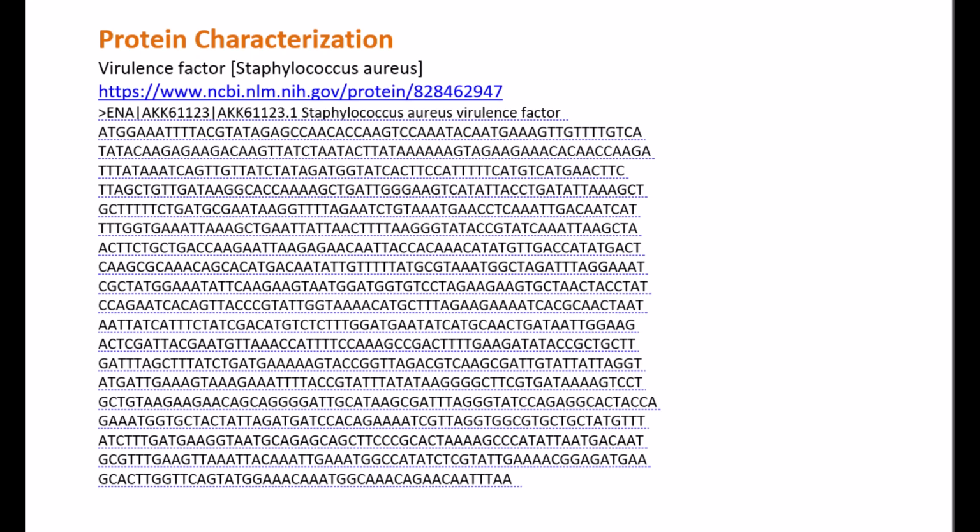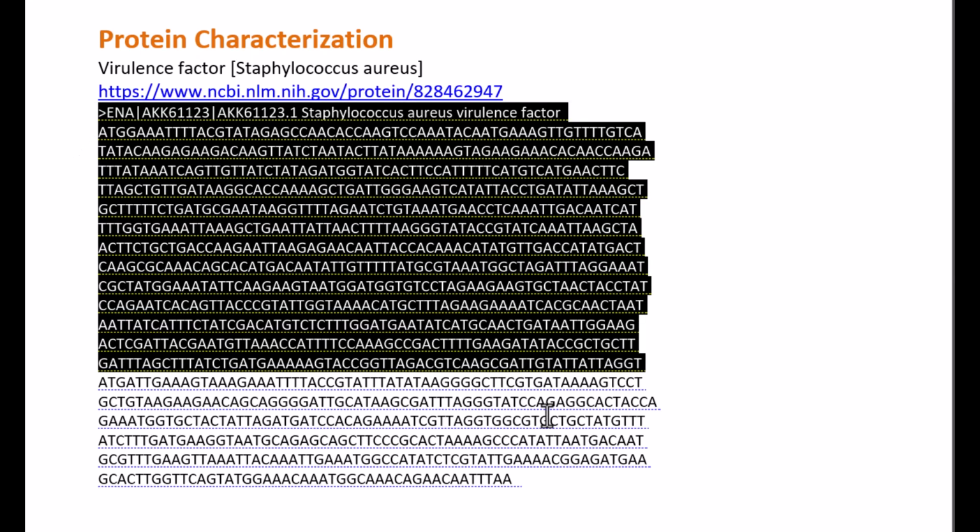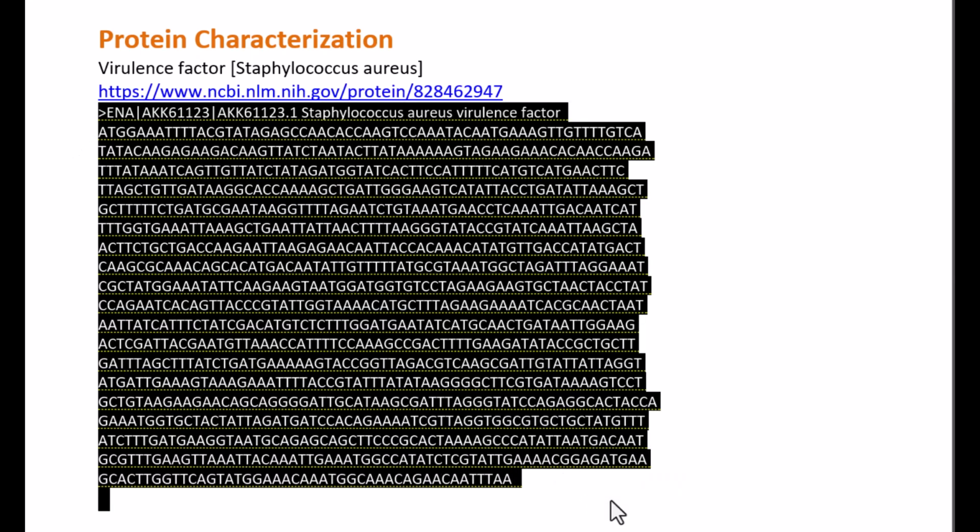Alright, in this video I'll explain how to look at some protein characterization and some parameters for protein identification and modification. So again, we've got this sequence here that doesn't look like anything, so we need to first... this is a nucleotide sequence, so you're going to first copy it, and we're going to translate it into a protein sequence so that you can use other programs for more information.